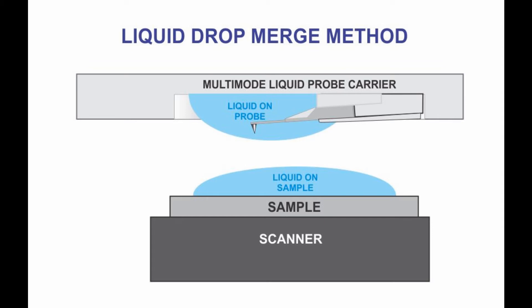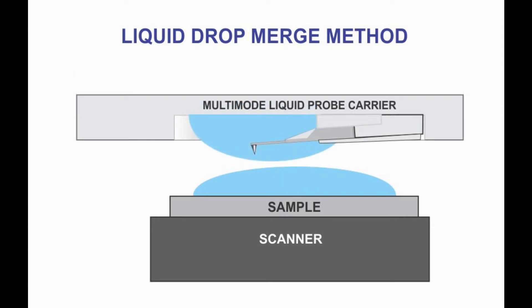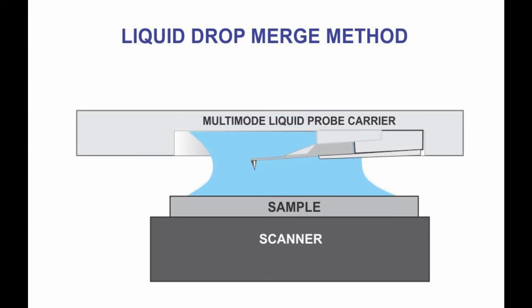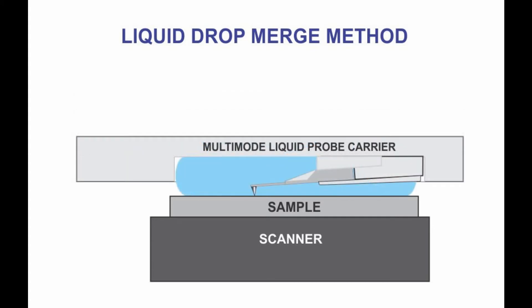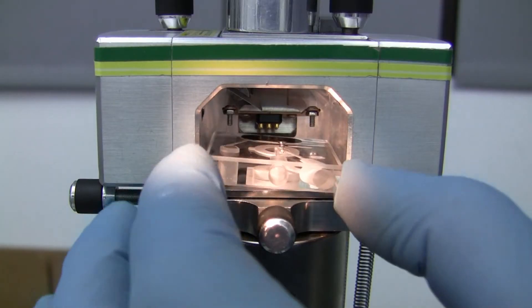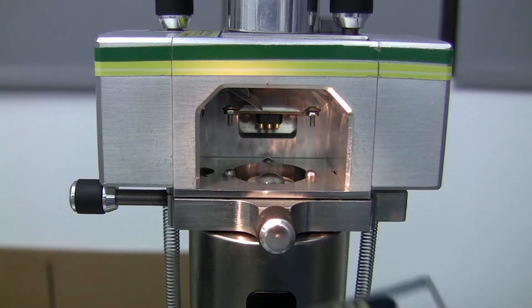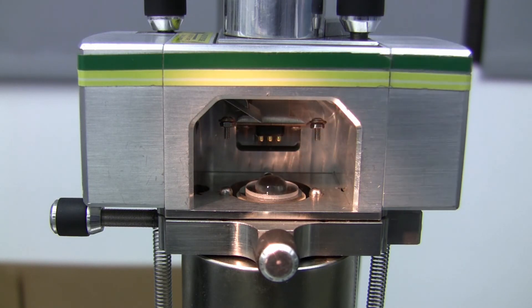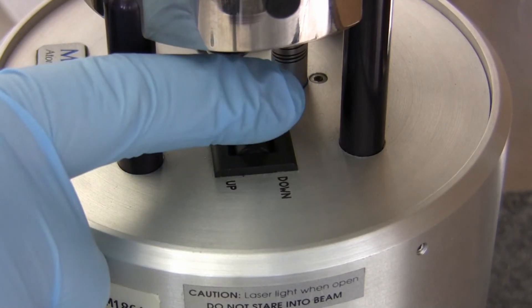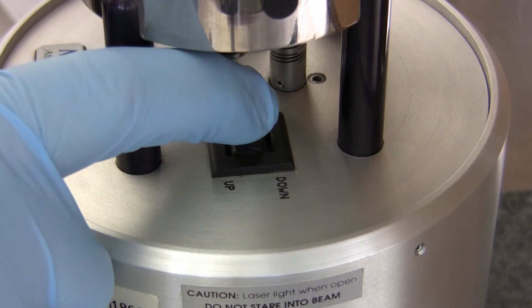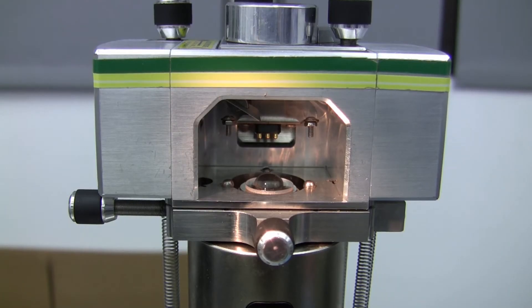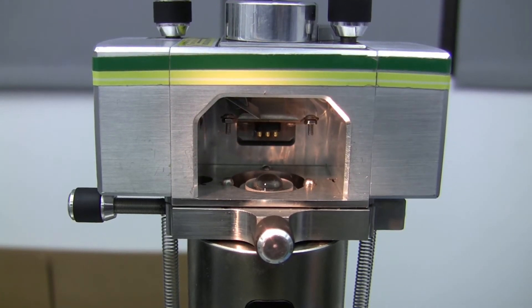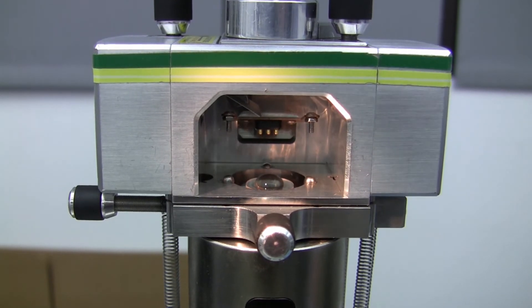The first common method of sample preparation involves placing a drop of fluid on the sample surface and the probe carrier and bringing the two drops together to fill the void inside the probe carrier cell. Remove the probe carrier from the head. Add enough liquid to the sample surface to create a large droplet in the center of the mount. Use the motor control to raise the head away from the sample and scanner surface. This will allow room for the carrier cell to fit in place with a droplet suspended from the probe.